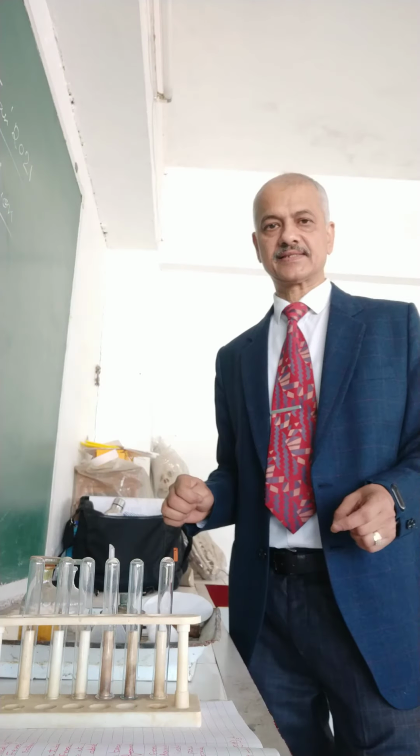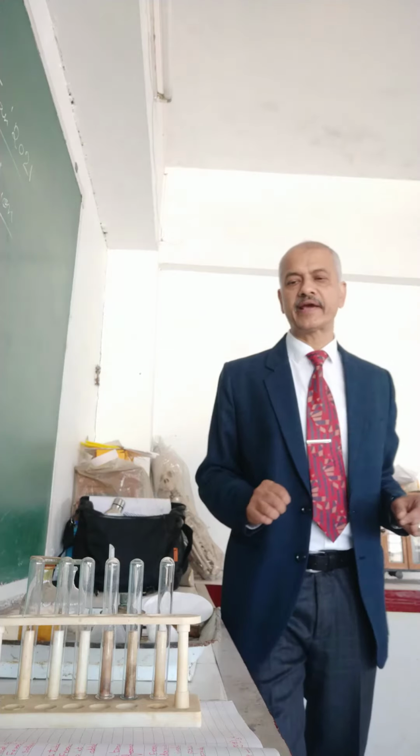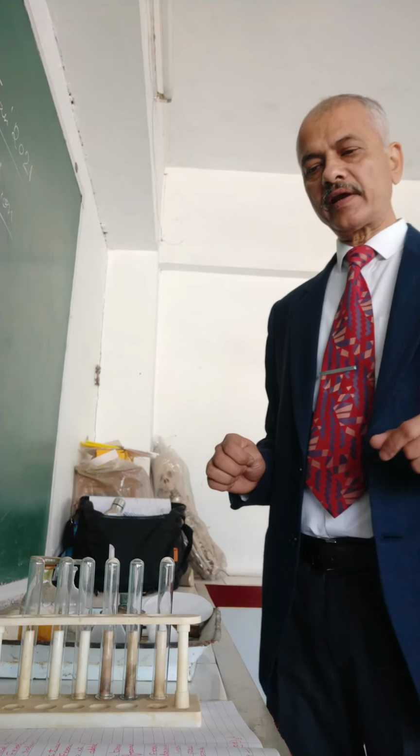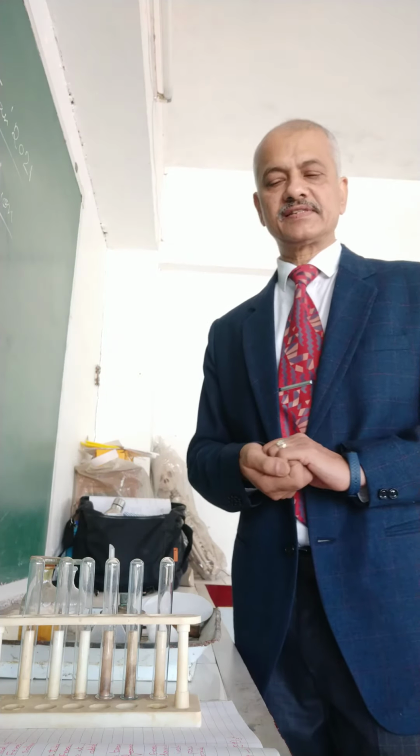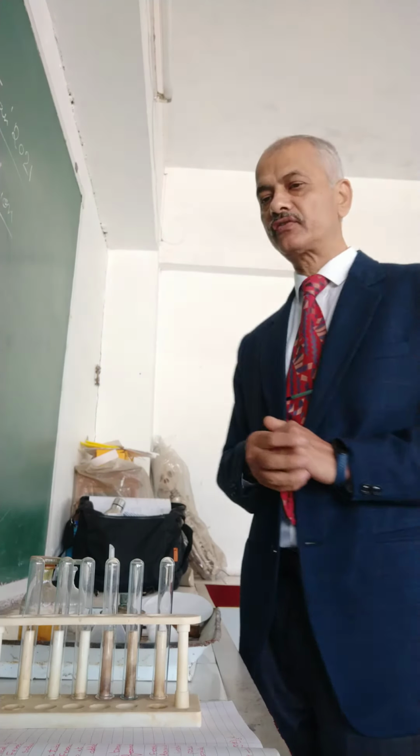Good morning, class 8. I am here again to show you an experiment based on chemical reactions. Chapter number 6, we are going to do an experiment on precipitation reactions.